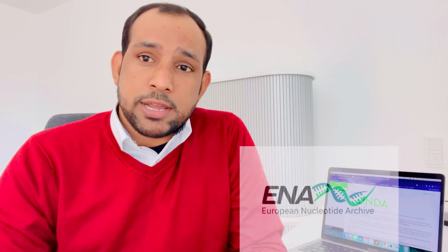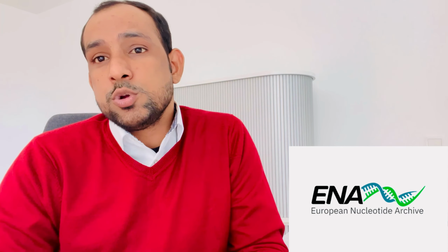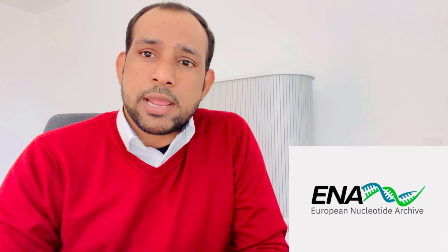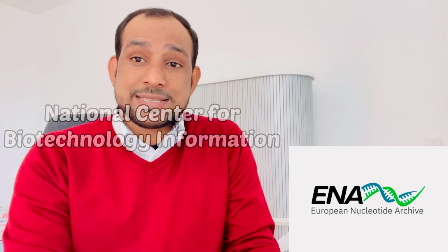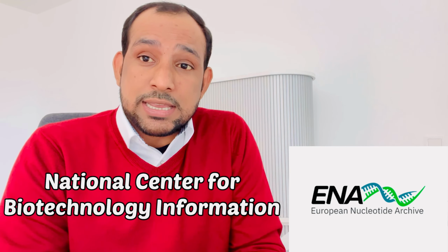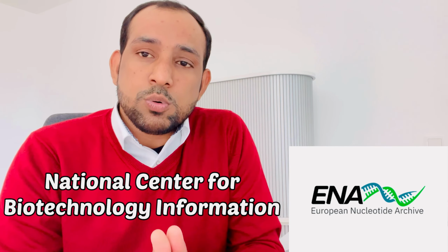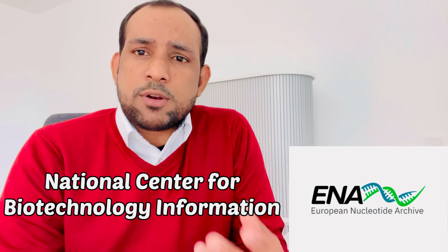The second database I would like to talk about is ENA, the European Nucleotide Archive. This is also very famous, and normally my first preference is NCBI and my second preference is ENA. Both have the same thing: you can get the data as well as the paper. The paper is kind of a guideline.